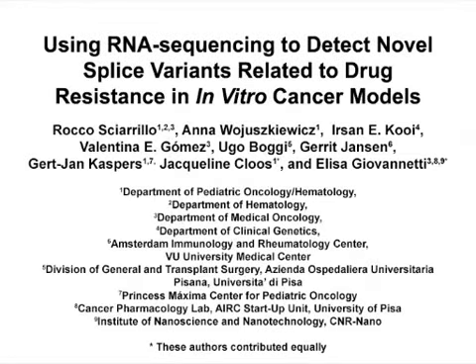The overall goal of this protocol is to investigate the association of aberrant splicing with drug resistance profiles in vitro models of solid tumors and hematological malignancies. This method can help answer key questions in the field of molecular pharmacology and chemotherapy resistance, such as which are the mechanisms underlying drug resistance on post-transcriptional level.